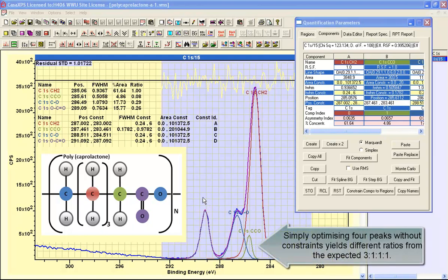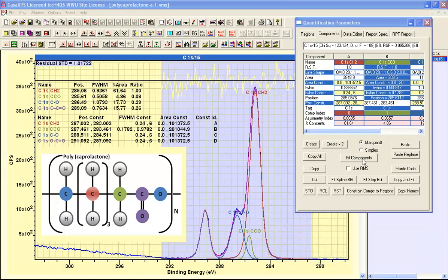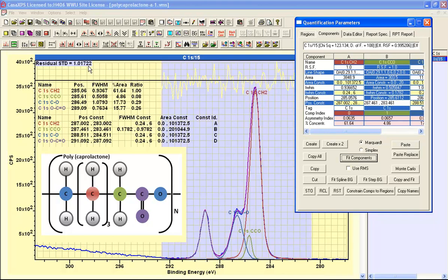Now in this case, the peak model is fitted without any constraints, and the result, as you can see, is a reasonable residual standard deviation, but the peak model is not reflecting the polycaprolactone structure.